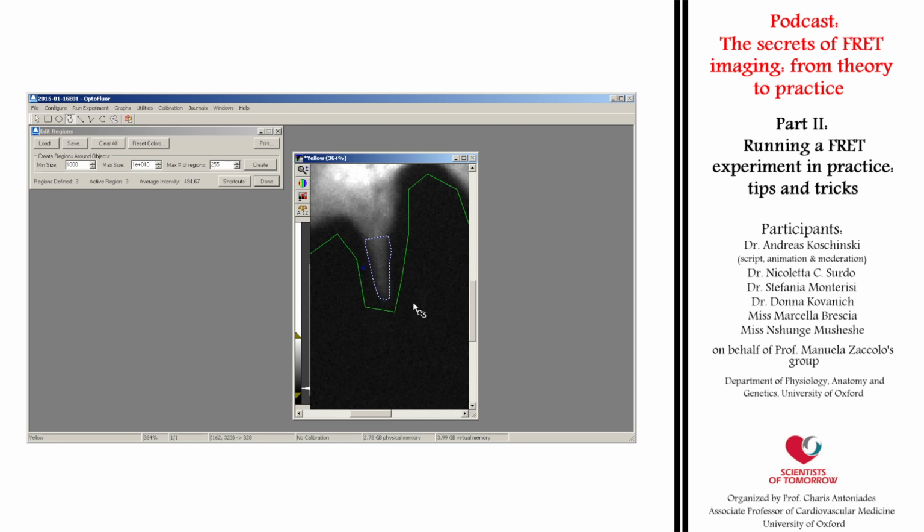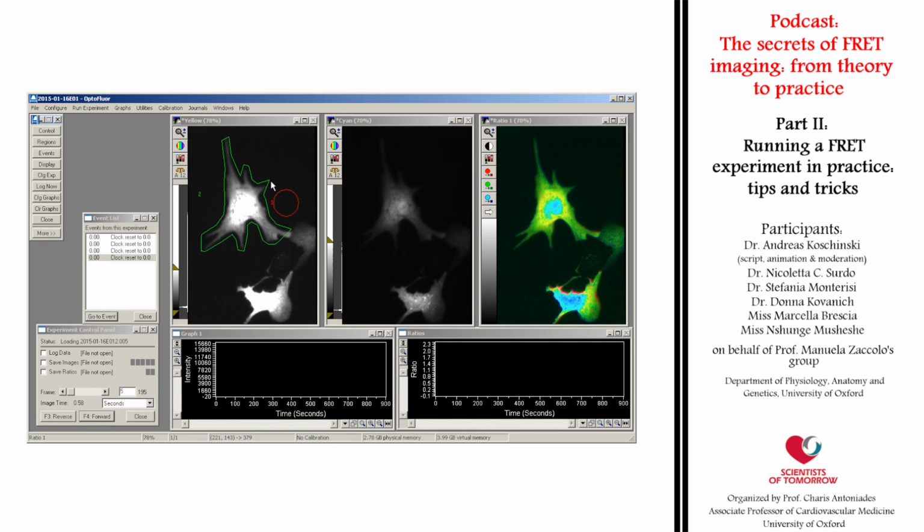As we are not interested now in this tail, we can delete this ROI by right-click and choose Delete Active Region in the pop-up menu. If all ROIs are created, we can return to the main program. Don't forget to bring the increased brightness back to a normal level.